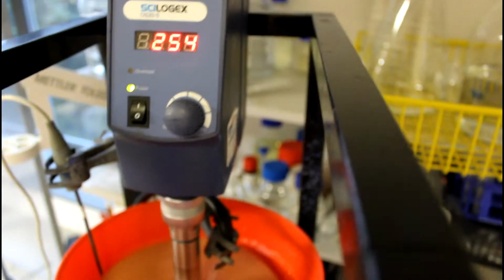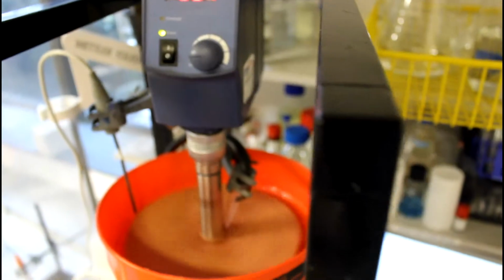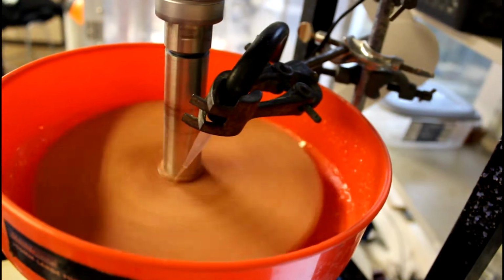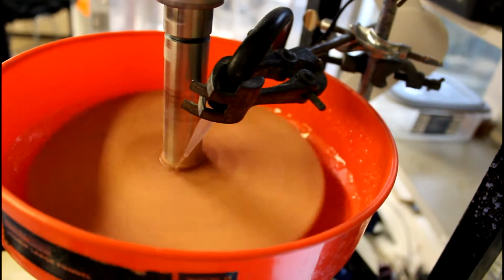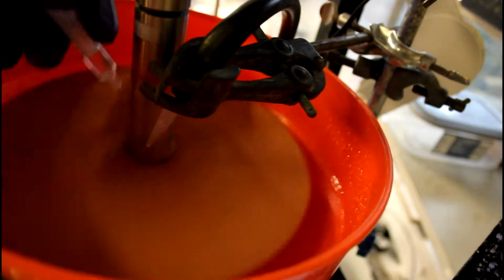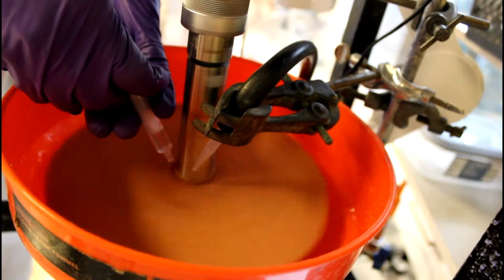So the spinning disc reactor has been set to 254 RPM and the liquid flow rate has been set to 5 mL per second. Deionized water is being passed through the reactor right now and the conductivity is being recorded on the PC using LabX software every second. I'm now going to add my tracer fluid into the center of the disc very quickly using a pulse injection method.